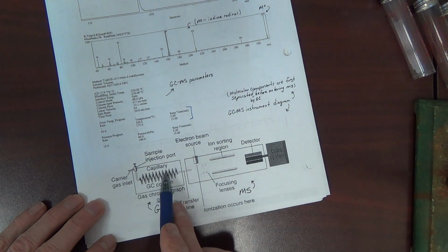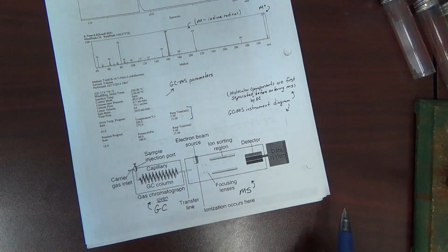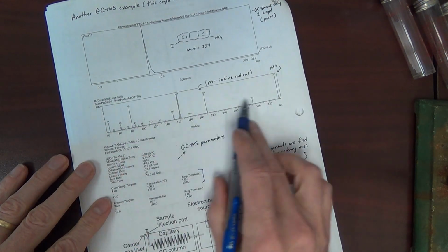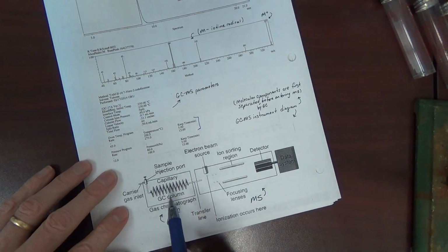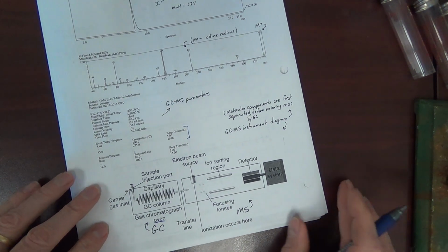Basically, things are separated on the column, and then this is connected to the mass spec. What you don't want to do is get a mass spec of a mixture, because it will be incredibly difficult to interpret. You'd rather have a mass spec of a single pure compound, and the GC column helps ensure that.